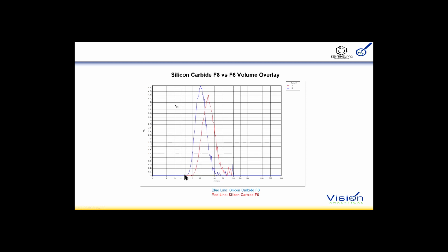That's pretty important. Number distributions instead of volume distributions focus our attention away from volumes and show all particles as if they're of equal standing. Looking at a number distribution instead of volumetric focuses on the number of particles in any particular size. In this case, we're going to be using equivalent circular area diameter without comparing perhaps better description of shapes because it looks like this number might be sufficient.